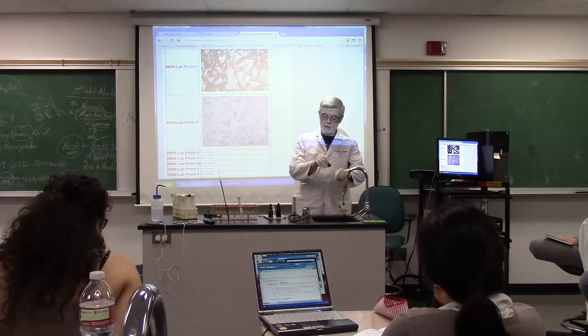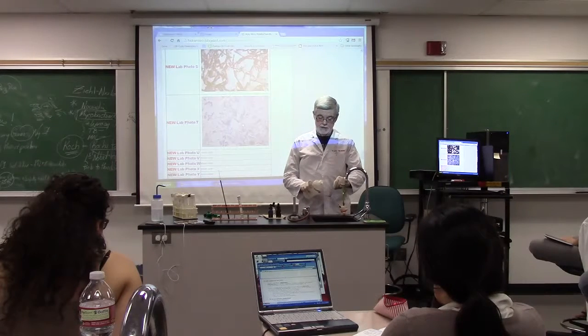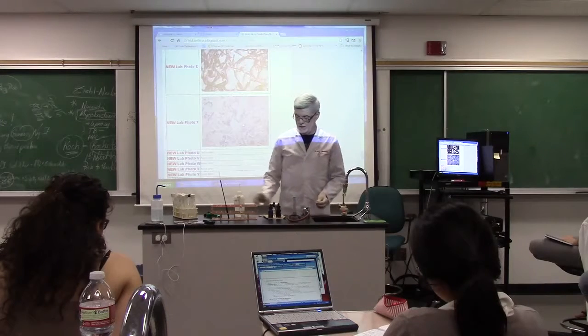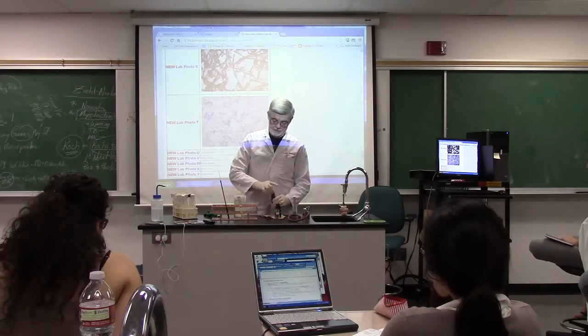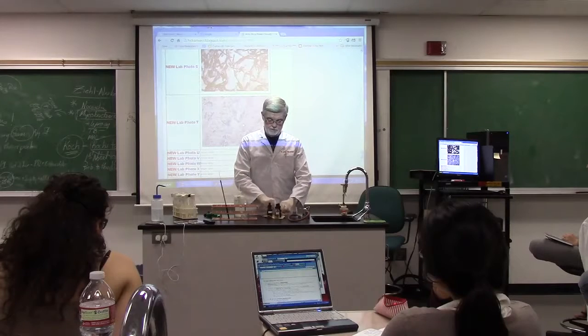Okay, and I'm going to aim above it. Shake and wash. You'll want to wash the back side, but not at the circle, just around it. Then lay it down like that and put your methylene blue on. Remember, since the previous step was water, you put the methylene blue on, shake it off, and put it back on.